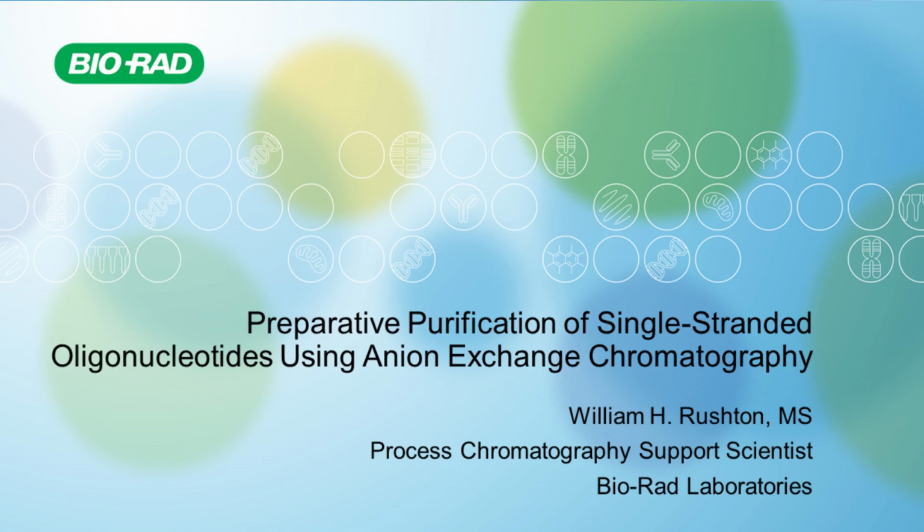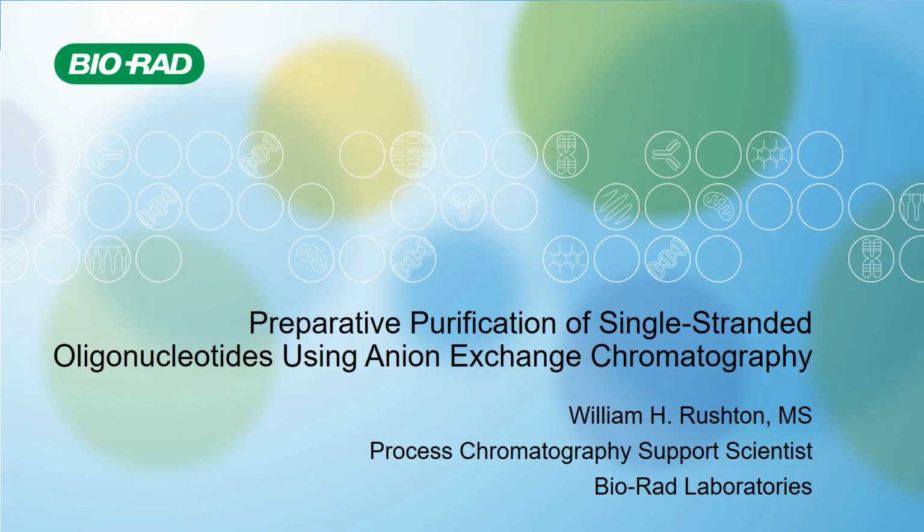It is now my pleasure to introduce our speaker, William Rushton, Process Chromatography Scientist from Bio-Rad Laboratories. Thank you very much for that introduction. Today I'll be talking about a preparative purification of single-stranded oligonucleotides using anion exchange chromatography.